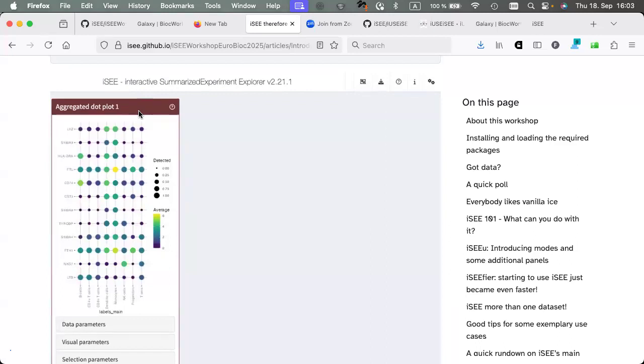How you can control how it looks in the visual parameters. Do you want to pass something, and you can actually select some of them and then have them split, because that's the one that you selected versus the unselected one? You can control it here.